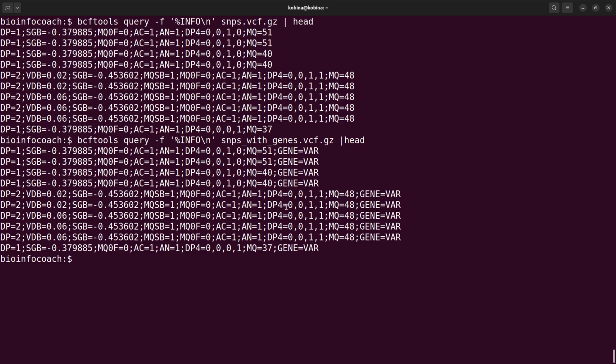So once you have this, then you can do other stuff. All right. Now this is a VCF file. If you annotate it, you can also export some of the information to a spreadsheet software that you can analyze or view. So for example, let's say we want the chromosome, maybe, and then the position, and then also the ref, alt, and then maybe the gene name. Okay, there are ways you can use to extract that information. Now I'm going to do just this simple command so that we can extract this information to a text file.